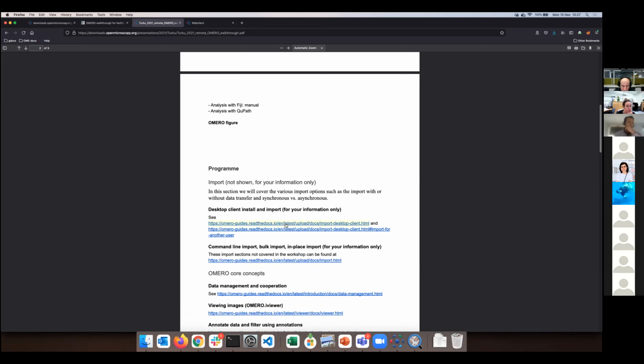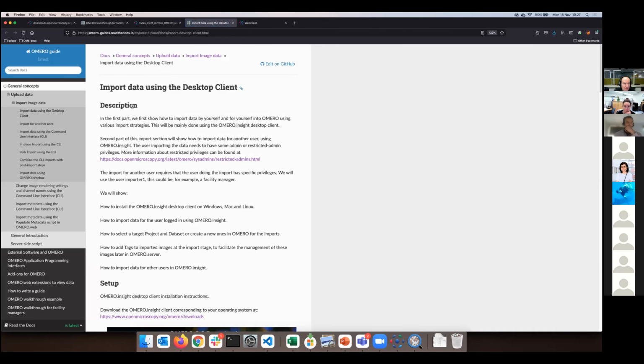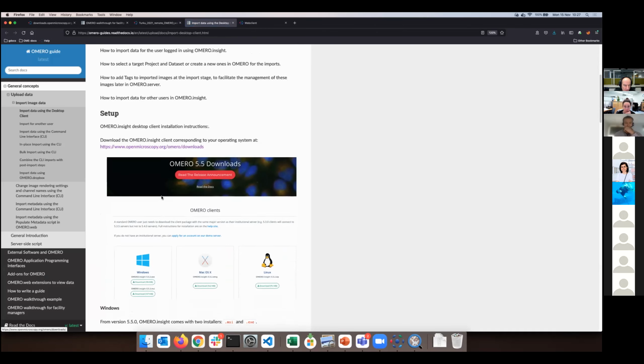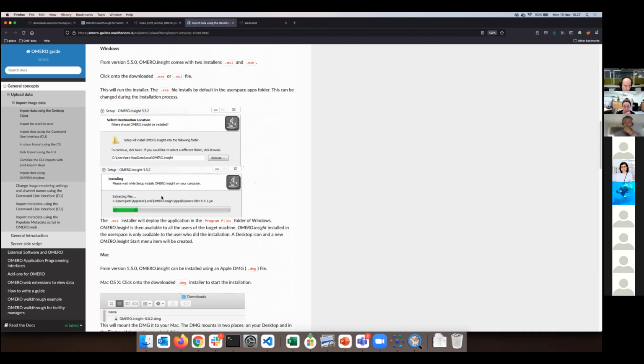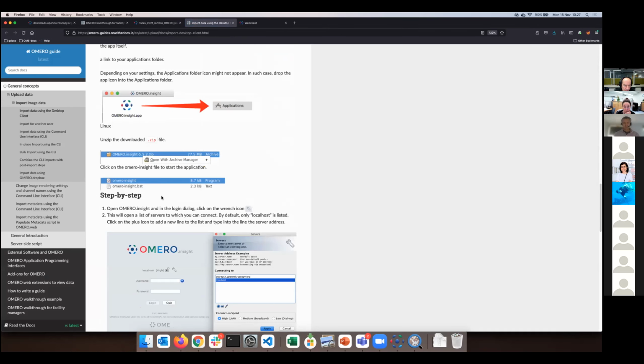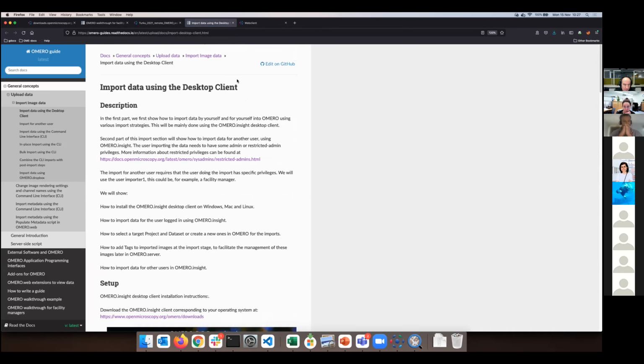We have also a walkthrough for that, and if I open this link in a new tab, you can see that this is the walkthrough we are going to follow. Okay, and we have a video on the YouTube channel which also goes through those steps. I'm sure that Jean-Marie would be able to find the link to the video directly. You have it in the email from Joanna as well. How to install Omero Insight.